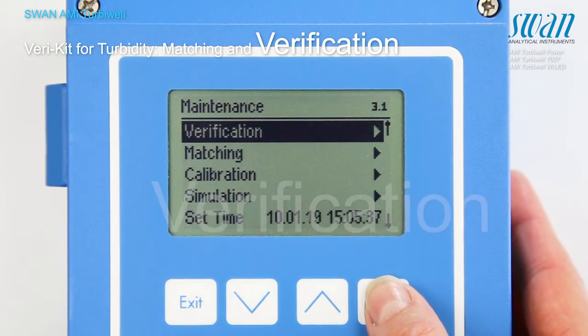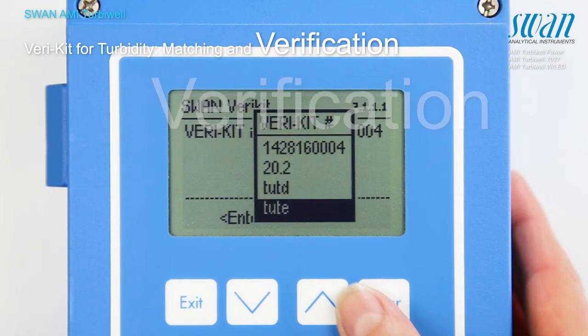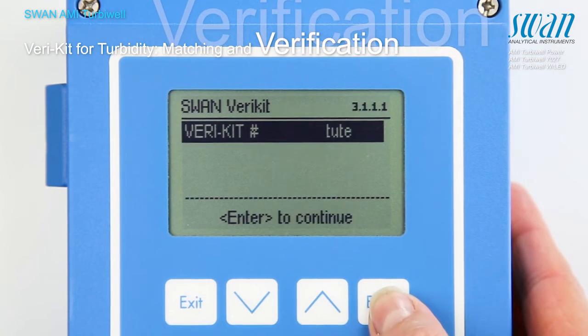The verification procedure is menu-guided. Choose the desired varikit from the list and proceed according to instructions on the screen.